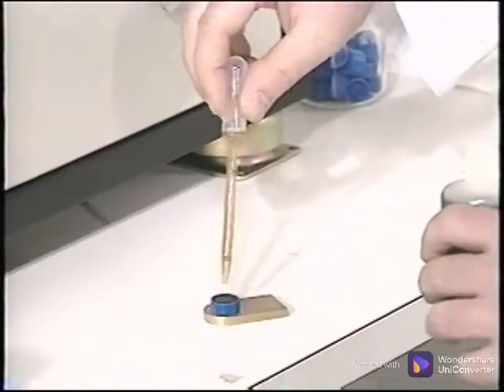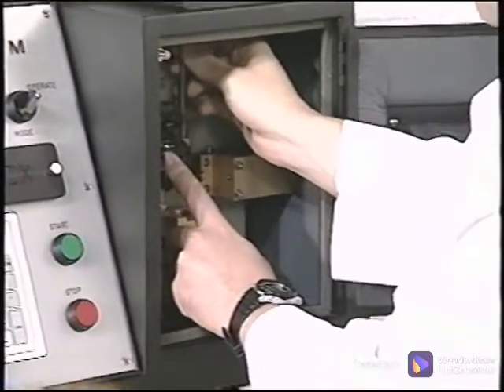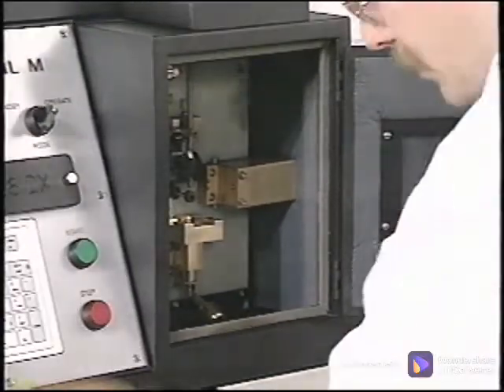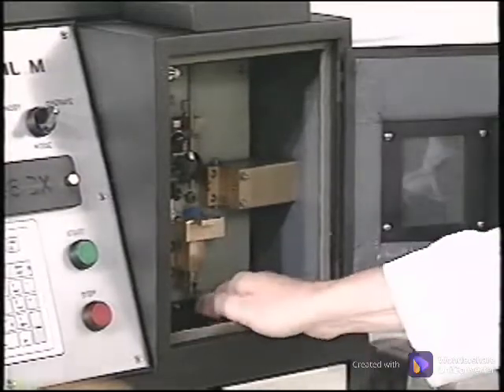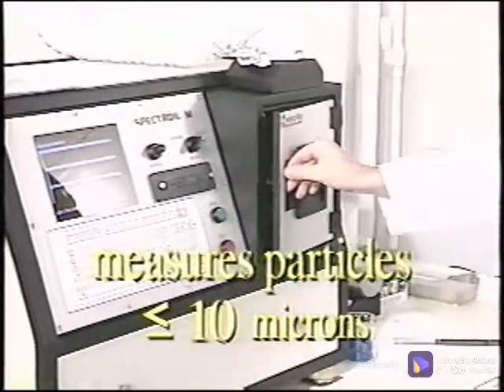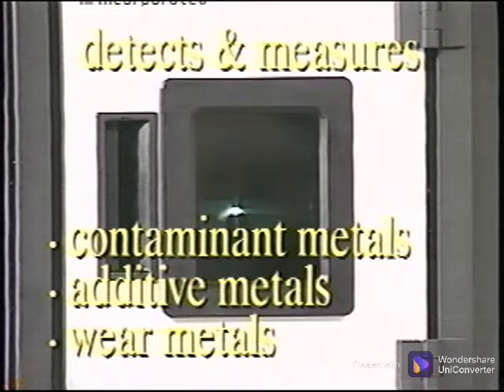The well-mixed oil solution is placed in a 1 milliliter bath with a carbon wheel dipping into the bath, bringing it up to another carbon electrode where the oil is energized, igniting the particles. The spectral colors are summed to determine the total amount for each element. The elements are recorded in parts per million for particle sizes less than 10 microns. The tests detect and measure contaminant metals, additive metals, and wear metals.